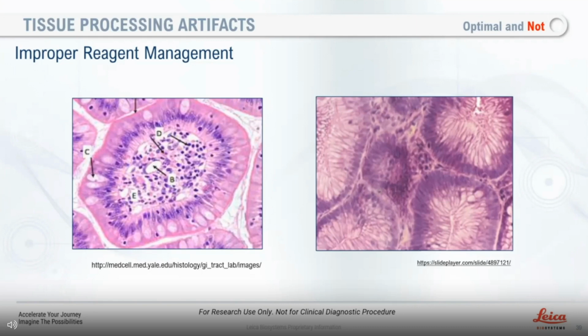The first thing that comes to mind, and it is a common practice that we see in the laboratory, is that the tissue cassette is 3 by 2.5 by 0.5 centimeters in dimensions, which is standard, right? For some reason, the person submitting tissue thinks that all of that is their real estate, and it's not. We need to leave at least a half a centimeter along the width and the length of the specimen so that fluid can flow through.